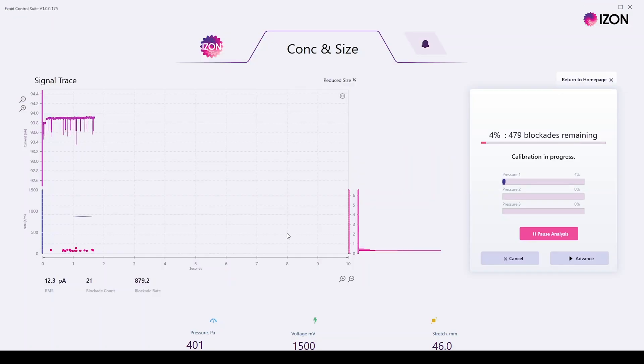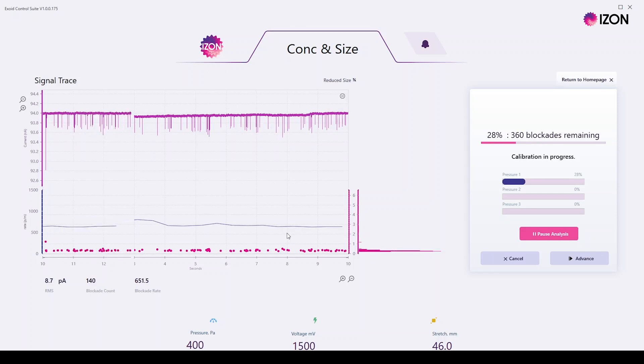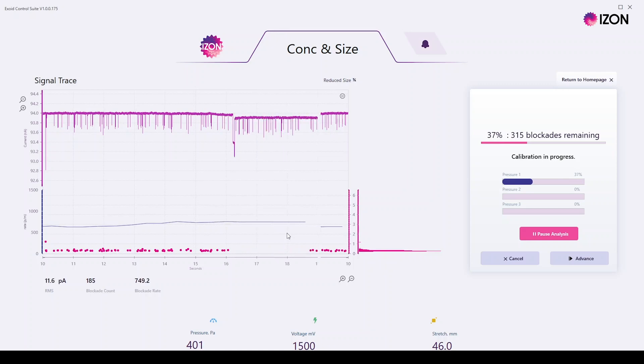Because increasing the pressure decreases the signal-to-noise ratio, one thing to watch out for during the multi-pressure calibration is the size of your blockades at the highest pressure. This will be 400 pascals higher than the first pressure applied, so during the ready-to-calibrate step it is a good idea to check the size of your blockades at the higher pressure to see if they are still larger than 0.2 nanoamps in size.